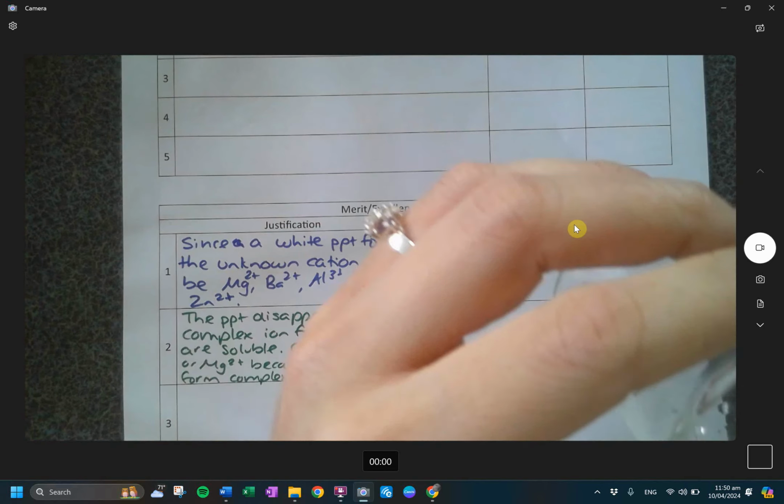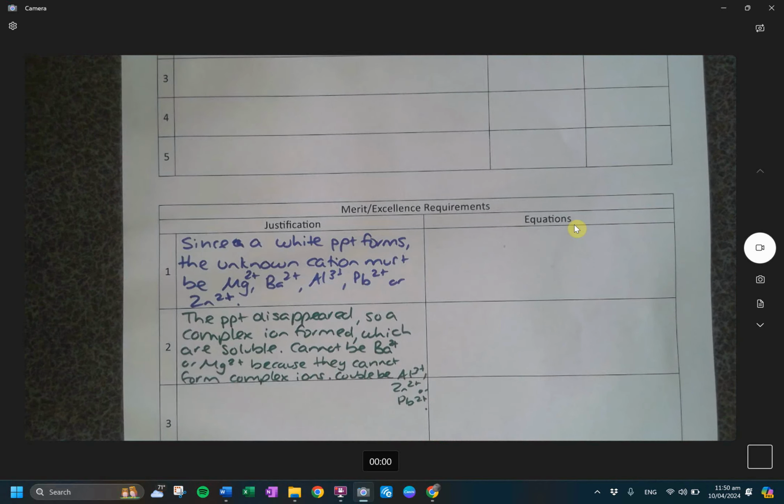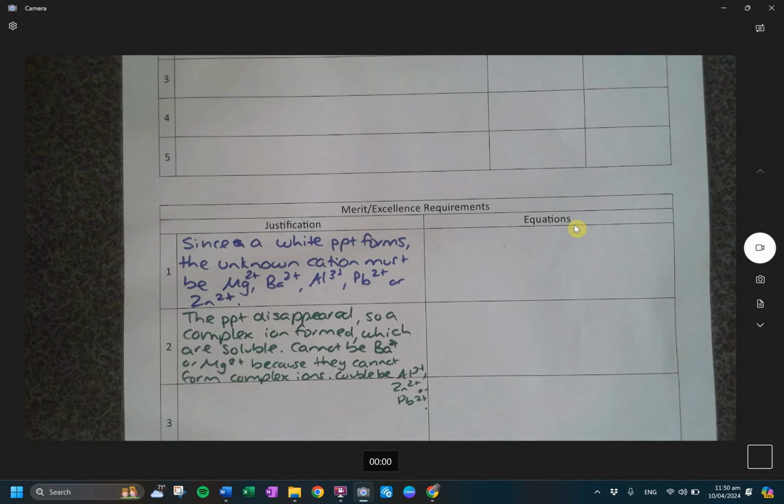Unknown. And again, we gotta play with it, right? Because if we overdo it, then we're gonna think it's zinc. How many people thought it was zinc yesterday? A lot of people. That's why we gotta test it out a couple times.